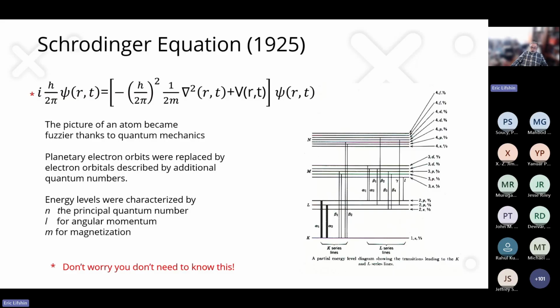And now we can start getting into understanding the terminology associated with spectra. If we have a transition from the L3 level to the K level, that's called the K alpha 1. And from the L2 level to the first level, that's K alpha 2.